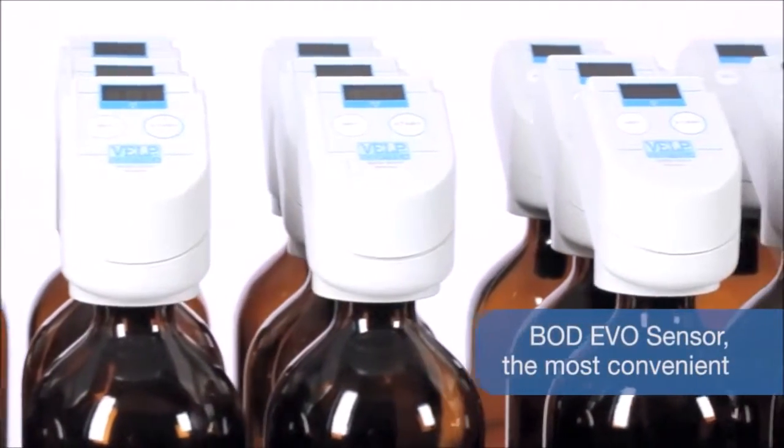BOD Evo is the most convenient way to get reliable results automatically on the biochemical oxygen demand.